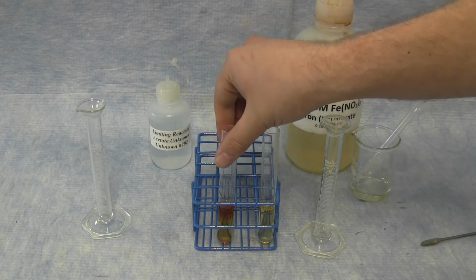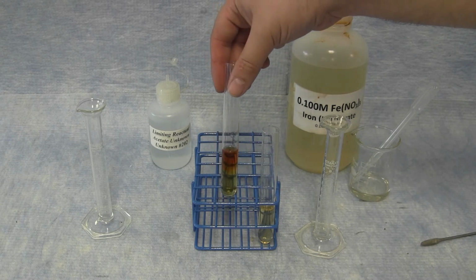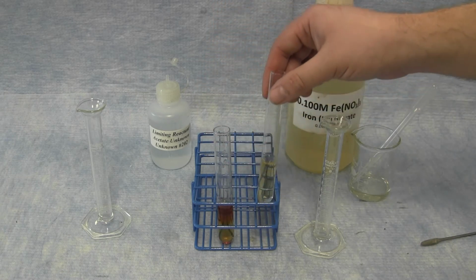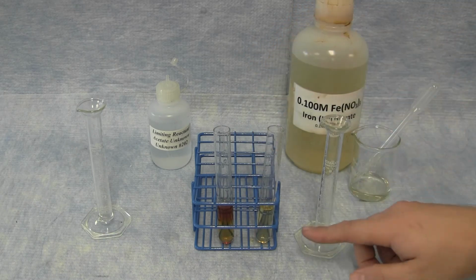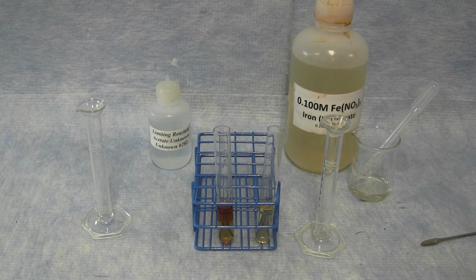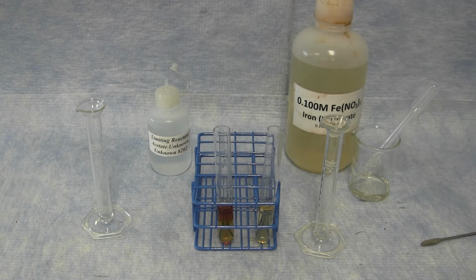Looking at these observations, the addition of acetate caused the darker color to appear, while the addition of iron 3+ caused even a slight reduction in the color. From these observations, you should be able to deduce that the acetate itself was the limiting reactant in the first mixture.